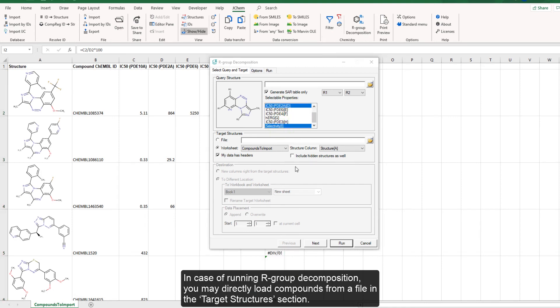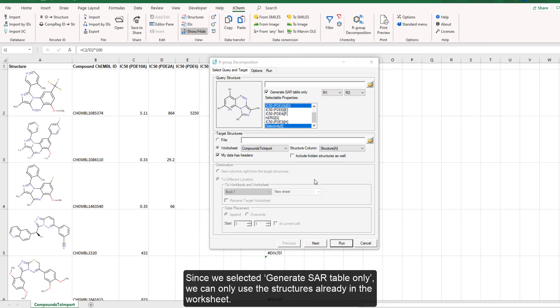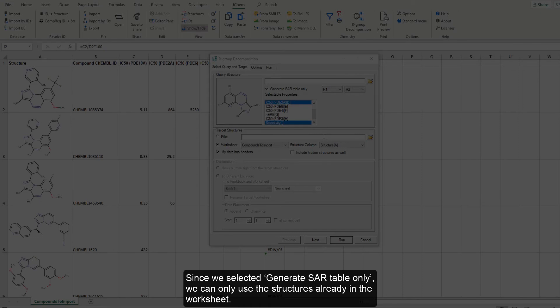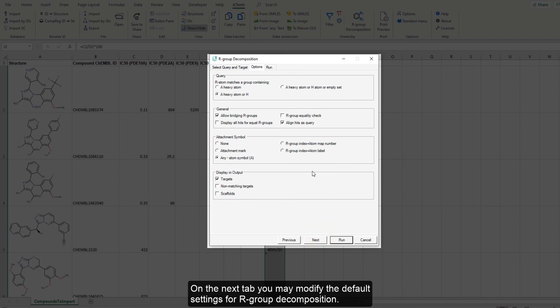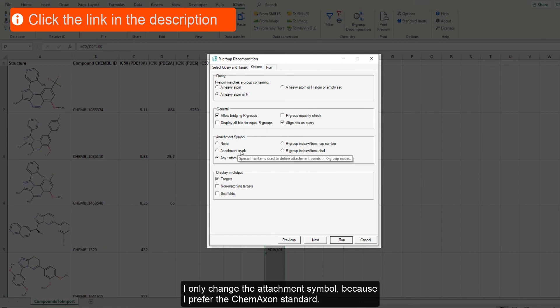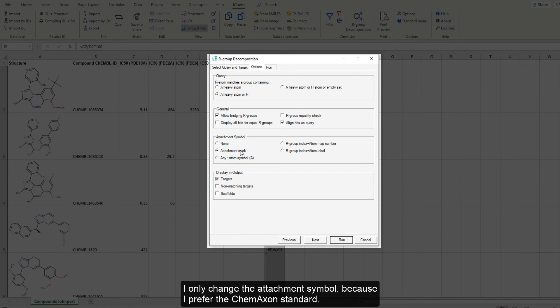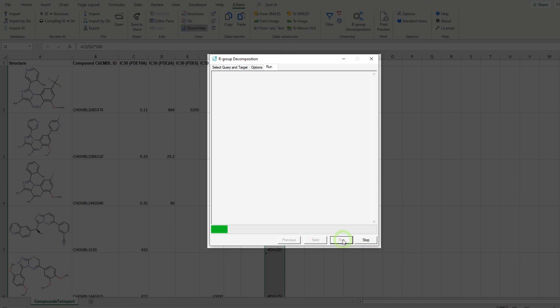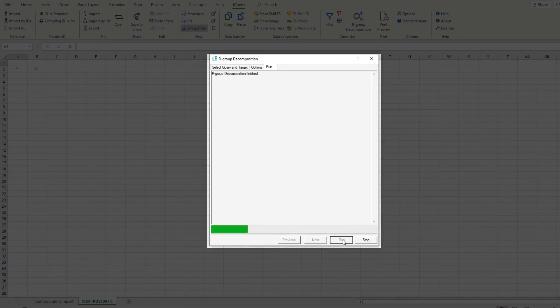In case of running R group decomposition, you may directly load compounds from a file in the target structures section. Since we selected generate SAR table only, we can only use the structures already in the worksheet. On the next tab, you may modify the default settings for R group decomposition. For more information on each of these options, please follow the link in the video description to our documentation. I only change the attachment mark because I prefer the ChemAxon standard.